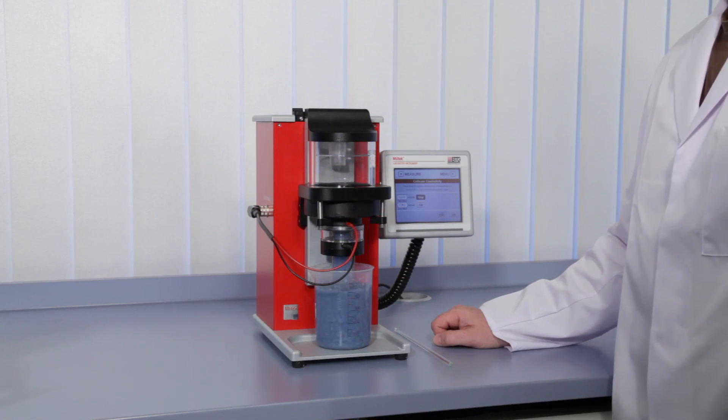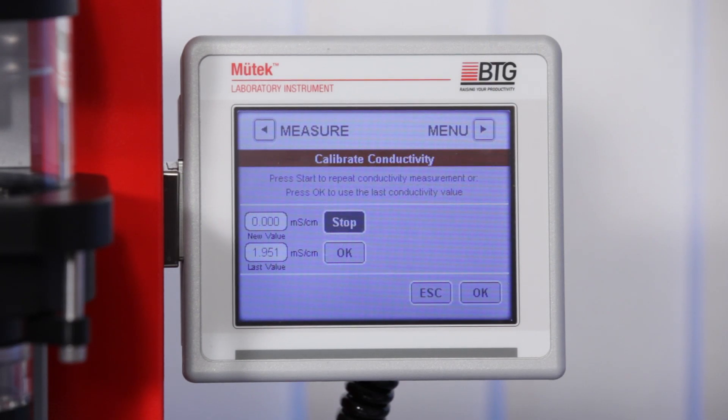It is recommended making a second measurement to confirm the first value. Alternatively, you may use the conductivity value taken from the previous zeta potential measurement, which is displayed in the field Last Value.